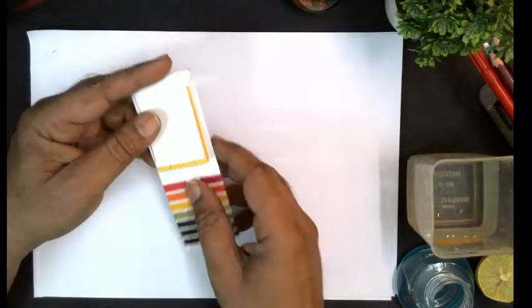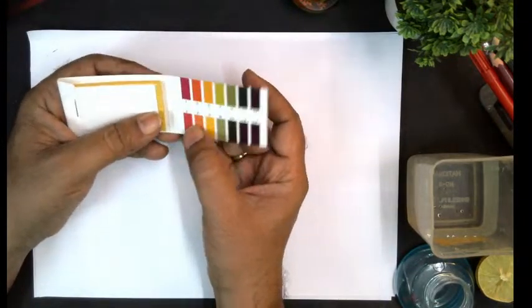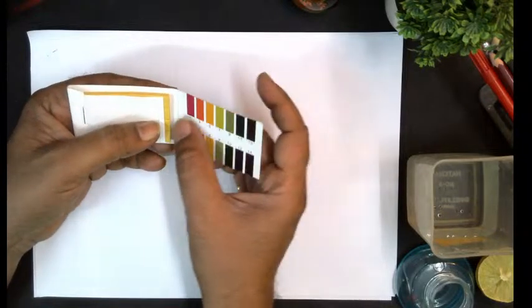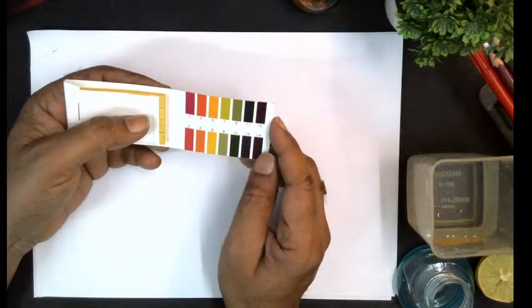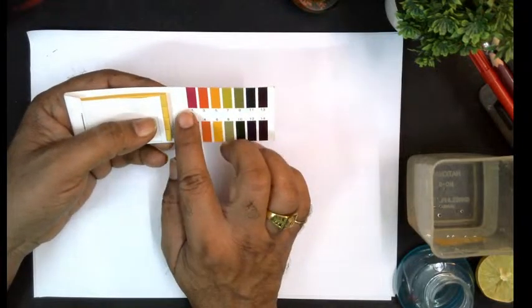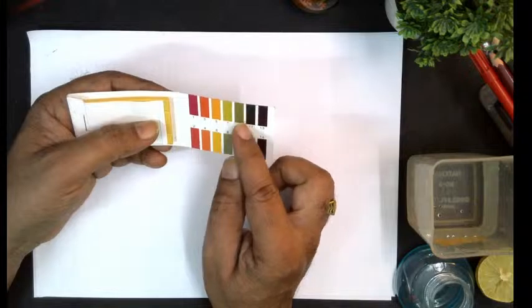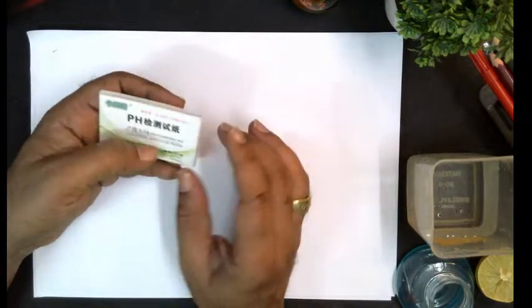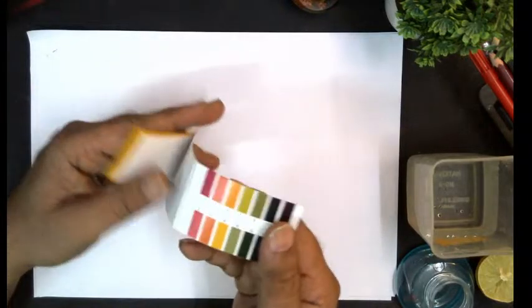I'm having this pH paper. It's a very simple card like this. It starts from 1, 2, 3, 4, 5, 6 and up to 14. So the pH range is 0 to 14. It is a wide range, and 0 to 7 is the acidic range, above 7 is the basic range, and 7 is the neutral range. And with this simple strip, we are going to show a demo.